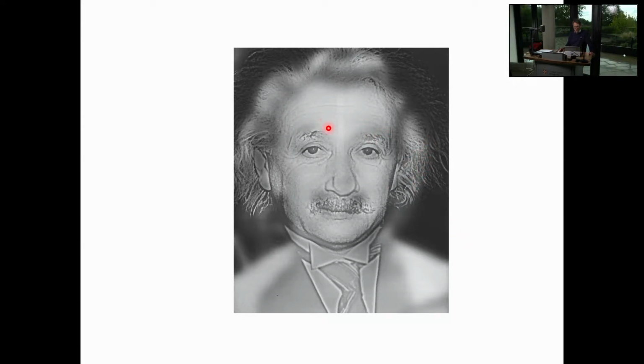If you look at the skin here, there's low frequency information, although he's got these creases here on his forehead, and perhaps you have a spatial frequency associated with that of 1 per centimeter, or 1 inverse centimeter, because you get this fine line, this pattern, changing in this direction.